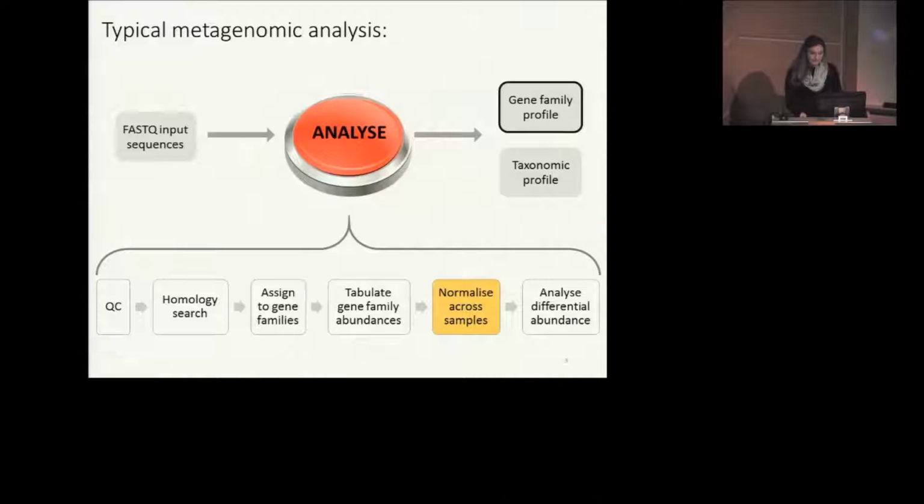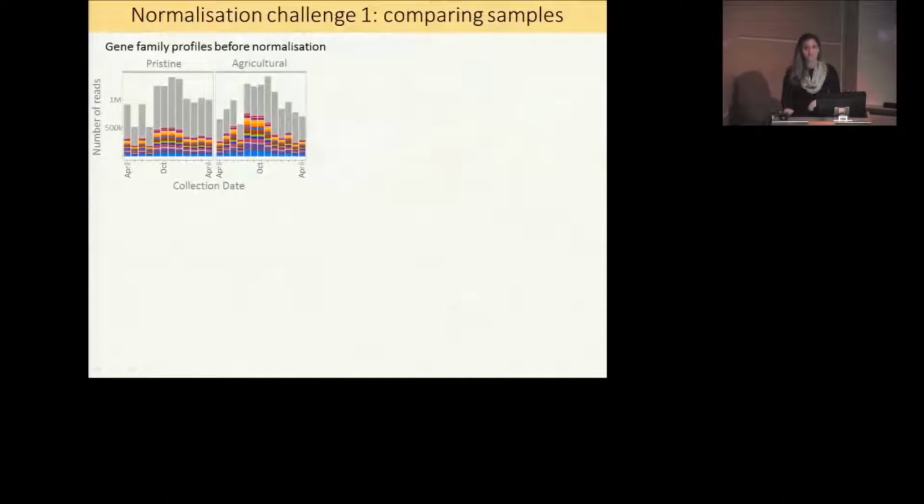There are a number of ways to do all of these different steps, and a number of criticisms of the ways that people do them. But today I'm really just going to focus on this normalization step. To talk about normalization, let's first look at the data before we normalize.